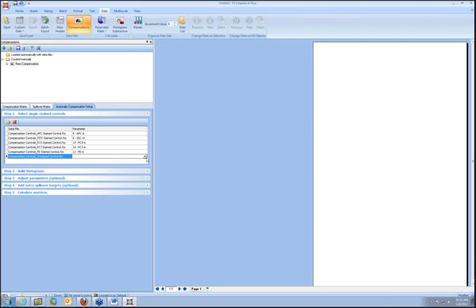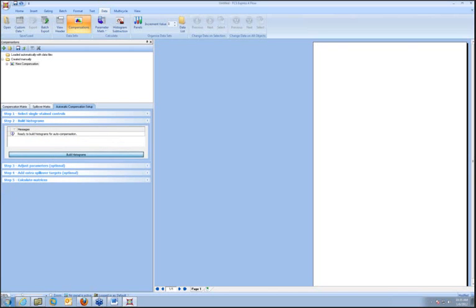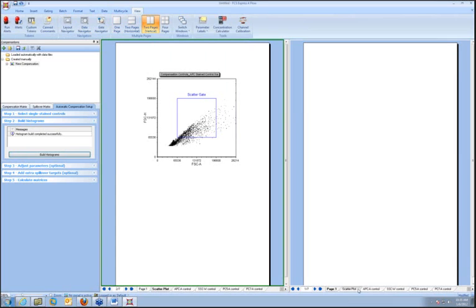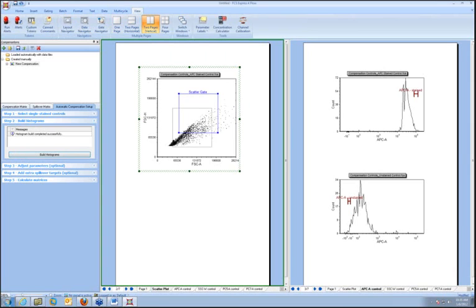And let's say I don't like that. Well, one thing that I'll point out over here, let me use a new feature of FCS Express where I can view two pages at the same time. And let's look at my APC control page. Notice that as I move the scatter gate, the position of my marker should be updating. Okay, so these are auto-detecting markers, and they should be updating. They are actually updating just slightly. It's just that the noise is not making it visible.